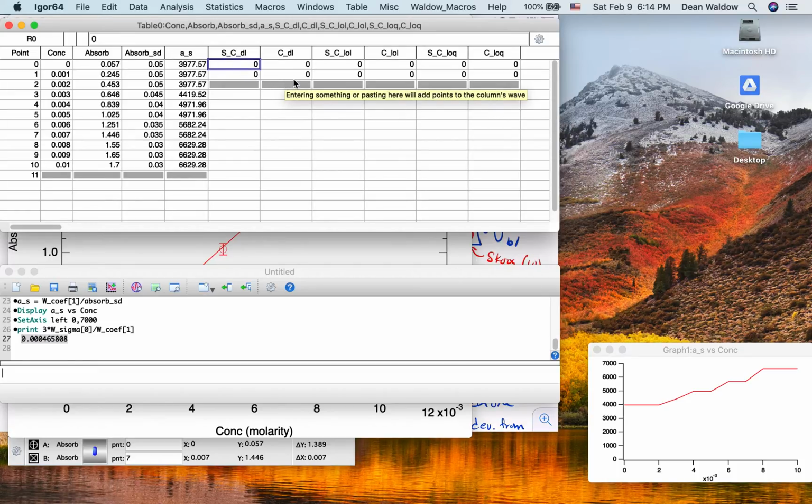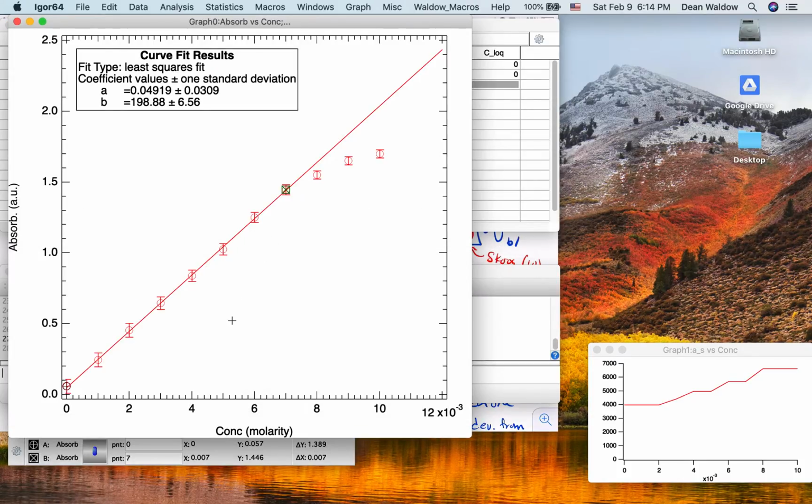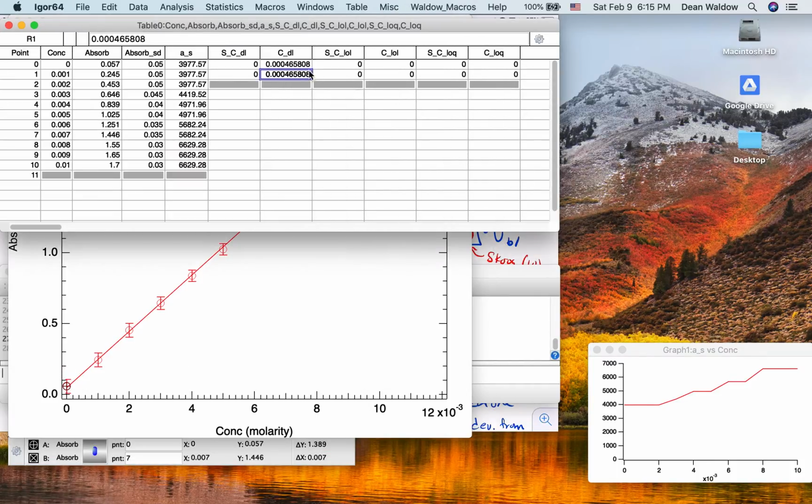as the C min, concentration minimum. And I'm going to repeat that twice, and I'm going to give another column or set of data that's going to be in absorbance units, just so we can maybe add this to the plot and get a better visualization. So I'm going to plot it from 0 to, say, 0.02. So I'm going to say 0 and 0.02.